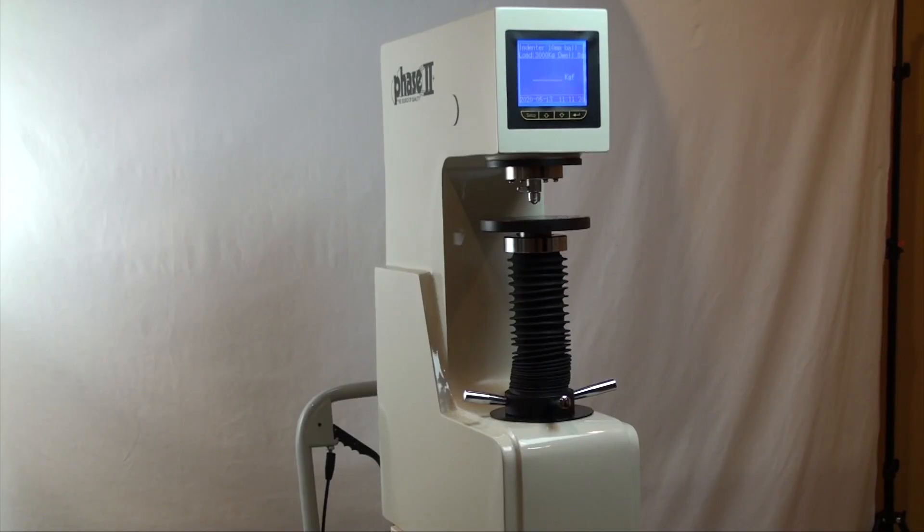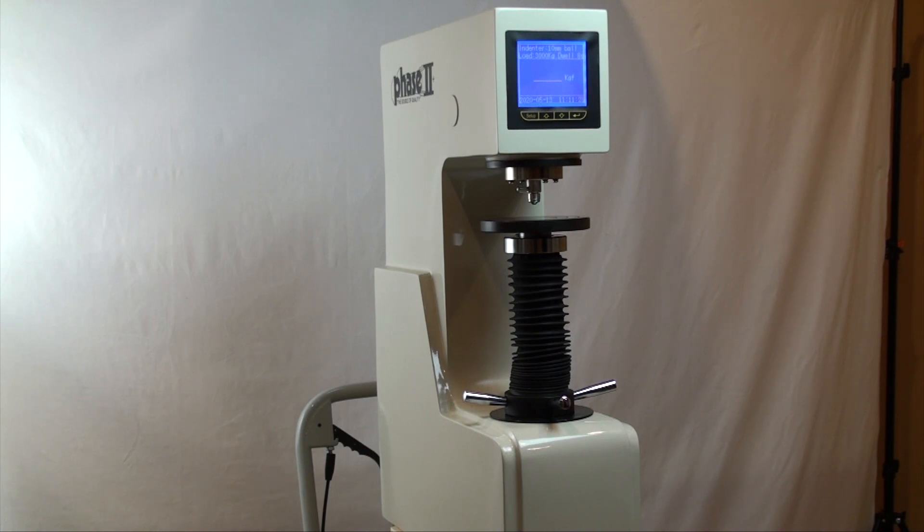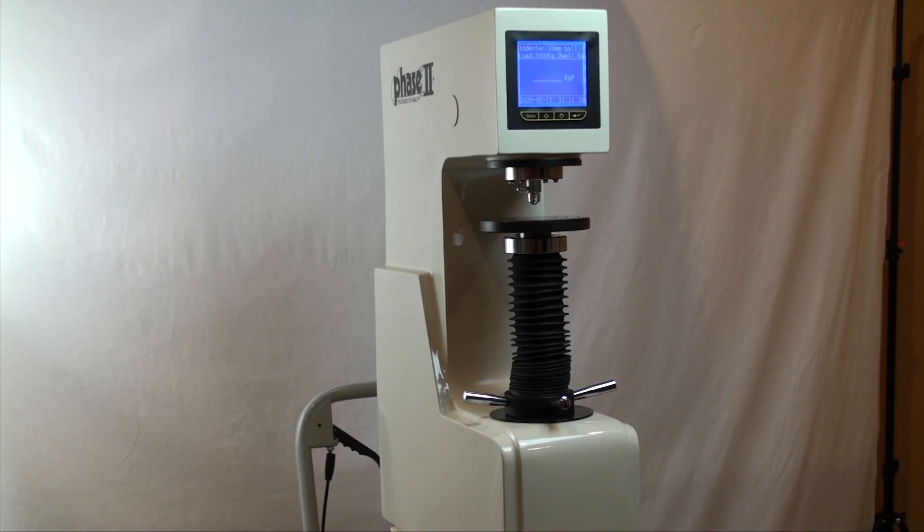This is an instructional video detailing the applications and functions of the Phase II Digital Brunel Hardness Tester. These hardness testers are designed to test primarily metals using the Brunel hardness method via a closed-loop load cell driven control.